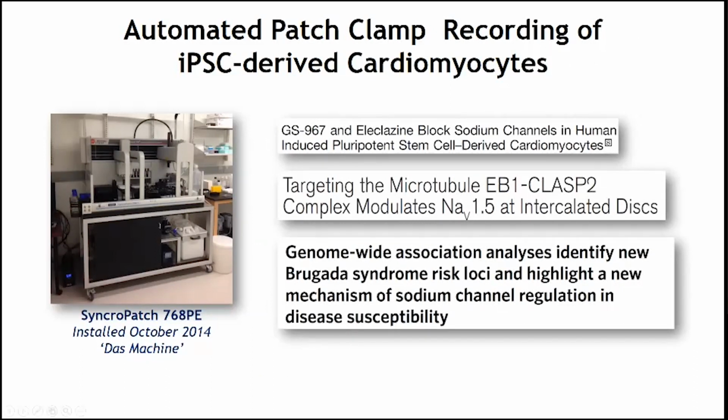The first study will be an example of how one might use induced pluripotent stem cell-derived cardiomyocytes for looking at novel pharmacological agents, in this case, novel sodium channel blockers. And then I'll highlight some collaborative work that we've done and contributed to that highlights some of the genetic risk factors for cardiac arrhythmias and how we've ascertained their molecular physiology.